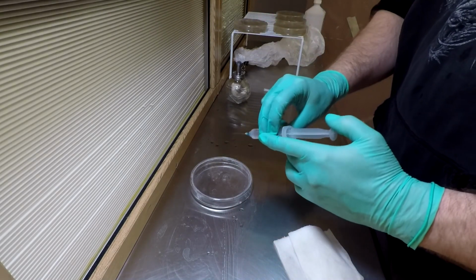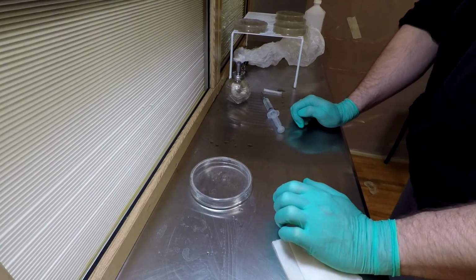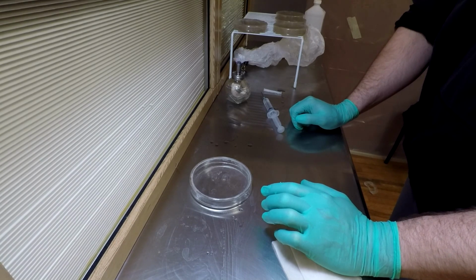Alright, I'll wrap those up and hopefully in another 5-7 days we'll see some king oyster mycelium this time and not some bacterial contamination.